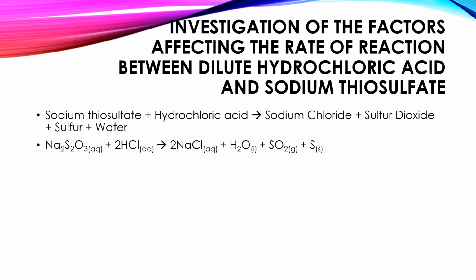The rate at which this precipitate forms can be changed by changing the conditions under which the reaction is carried out. So in this experiment, you will study the effect of changing the temperature of the sodium thiosulfate solution.